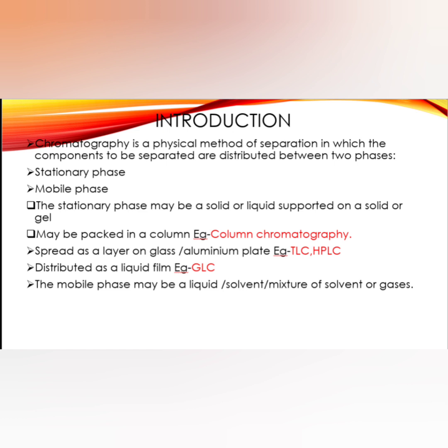Introduction. Chromatography is a physical method of separation in which the components to be separated are distributed between two phases. One is the stationary phase and another one is the mobile phase. The stationary phase may be a solid or liquid supported on a solid or gel.